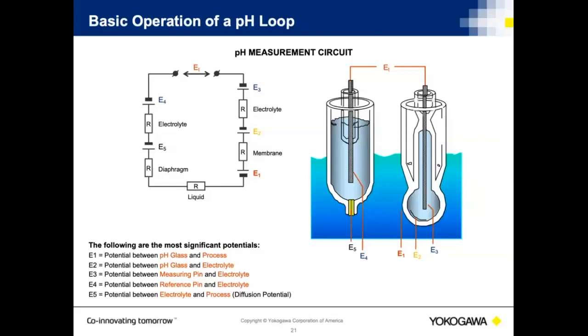The reference electrode is immersed in a potassium chloride solution, whereas the pH silver-silver chloride electrode is immersed in a 7 buffer solution. The point is the reference probe makes contact with the solution. The measuring electrode is actually where we make the measurement.